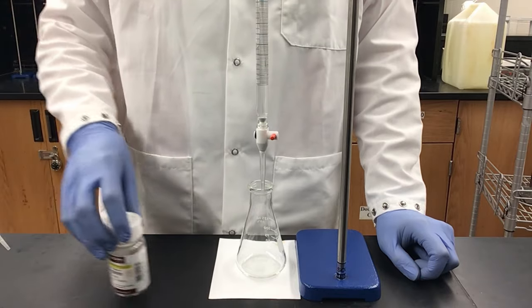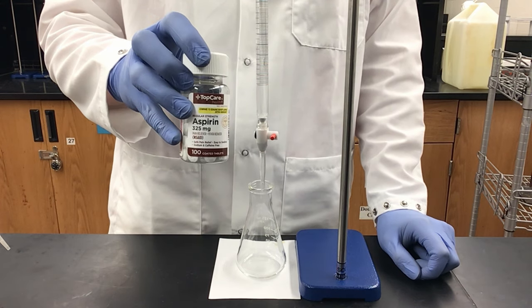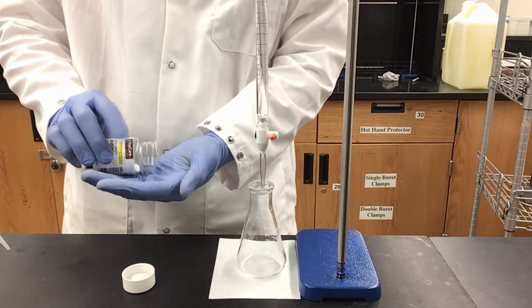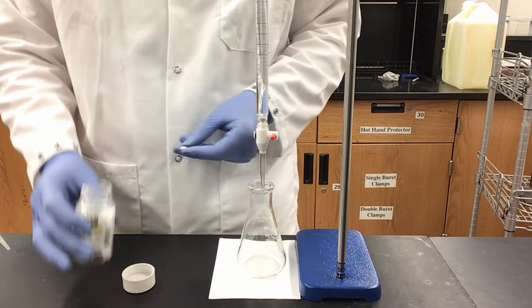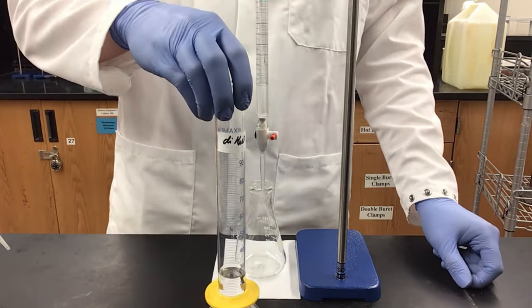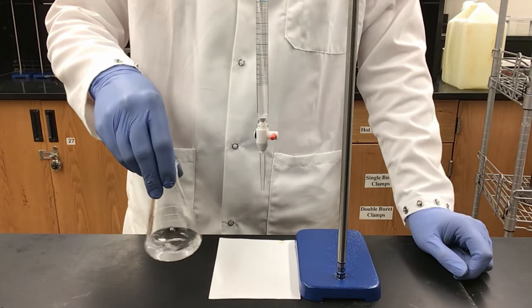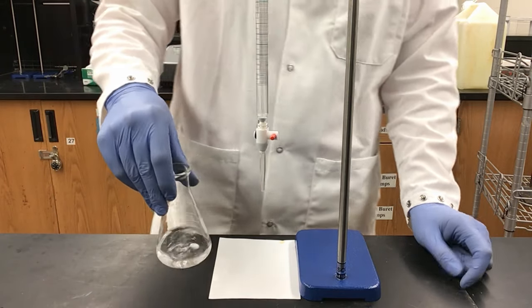Next we are going to be titrating aspirin to check its acid content. This bottle says it has 325 milligrams of aspirin per tablet, so I'm going to take one tablet and add it directly to my flask. I'll take 25 milliliters of DI water and add it to the flask, then swirl until the aspirin tablet begins to crumble and dissolve.